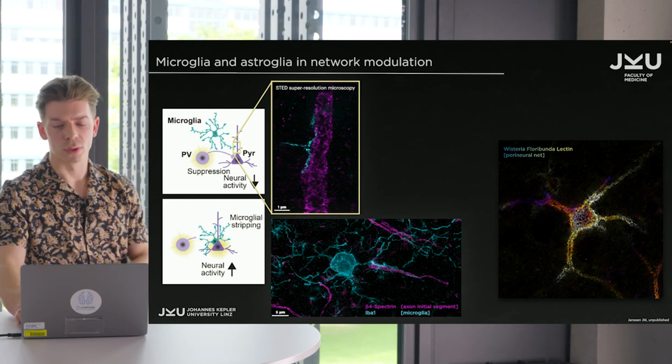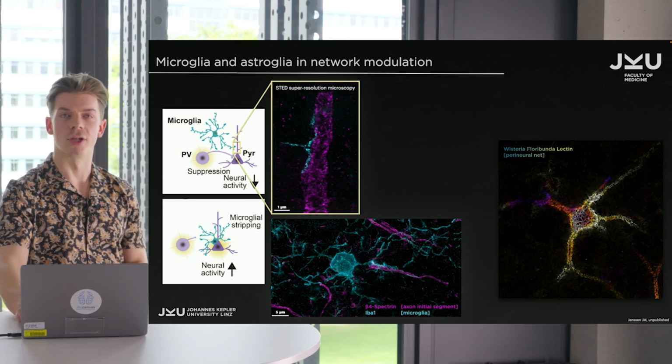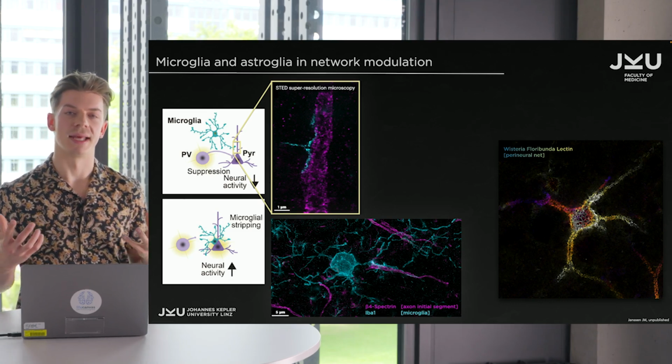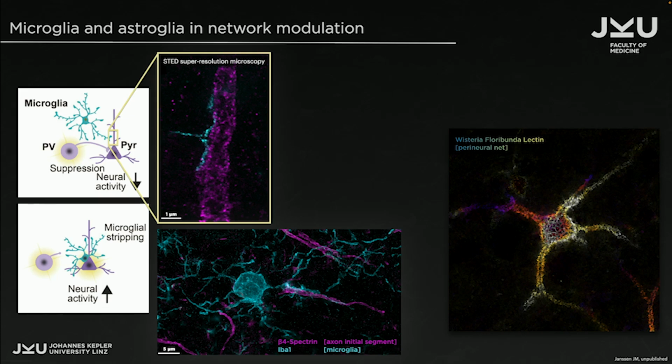And we combine these images with several key players that are known to form the outer membrane and the protective structure of our neurons and interneurons, like the perineuronal nets that form large proteoglycan networks around the neuronal body and the dendrites and the axon, and thereby work as a protection layer that keeps microglia from attaching to the AIS or to the neuron body and keeps it from modulating any synapses that could be structured alongside the AIS.